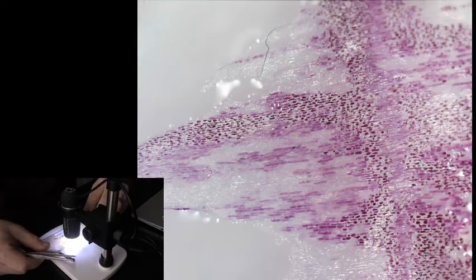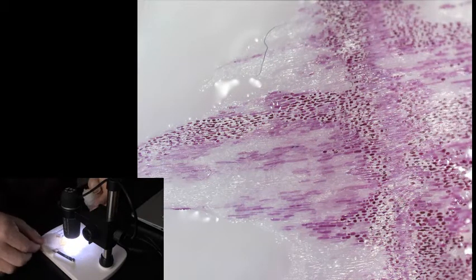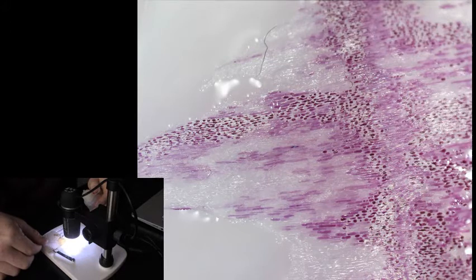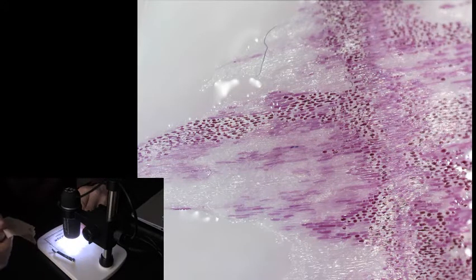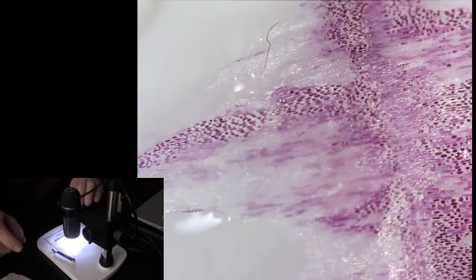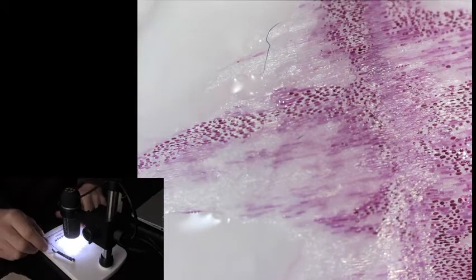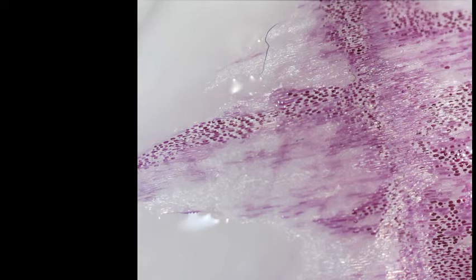The cytoplasm is a lower concentration inside the cell. The distilled water outside being 100% is a much higher concentration. That water is going to rush in through the cell membrane of the cells into the cytoplasm and essentially blow them up. So water is going to be going from high concentration outside the cell to low concentration inside the cell.